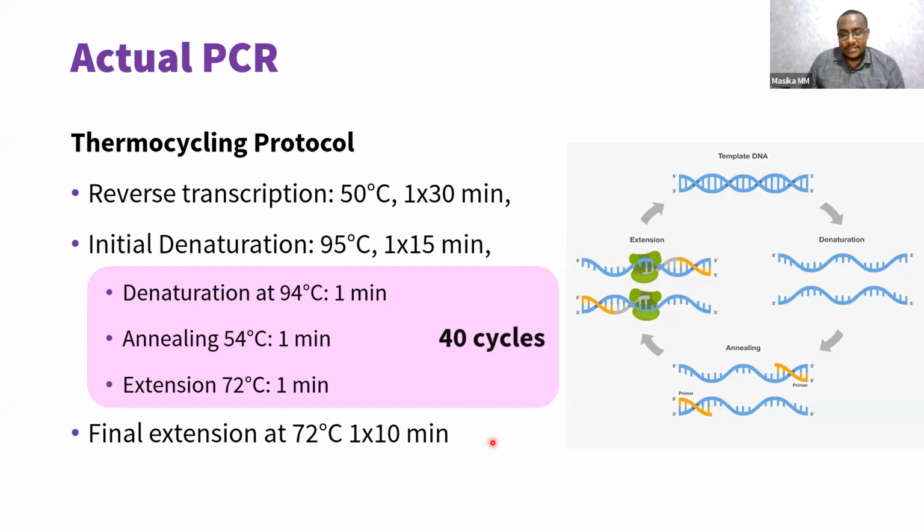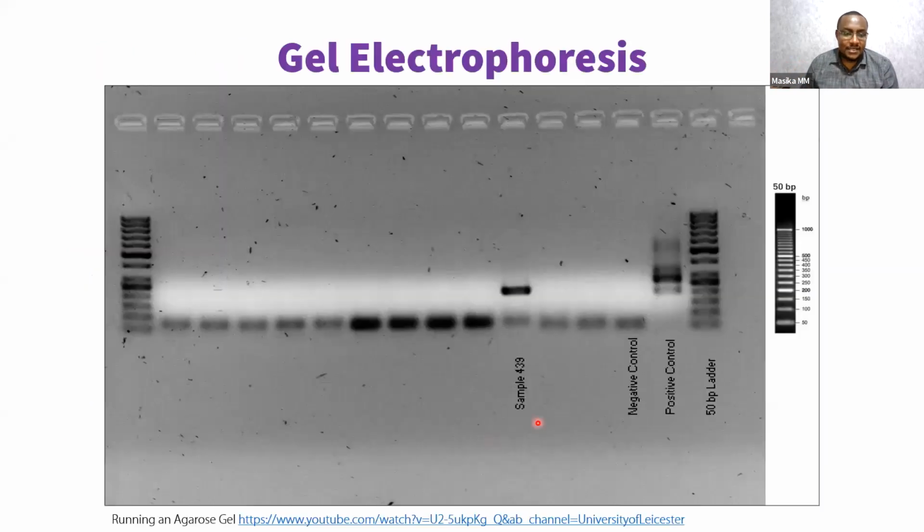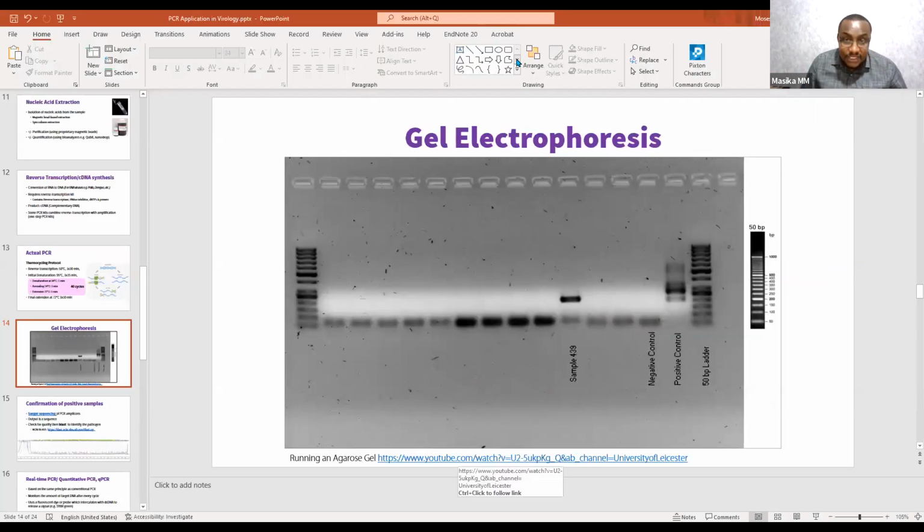And then after that, if it is an endpoint PCR, you can visualize on a gel like this one. But if it is a real-time PCR, I'll show you how we visualize. And what we do with gels, I think maybe I should show you the gel, that's how it looks like. In the video you saw it, but I'm going to do that again. Just a short brief bit on the video.